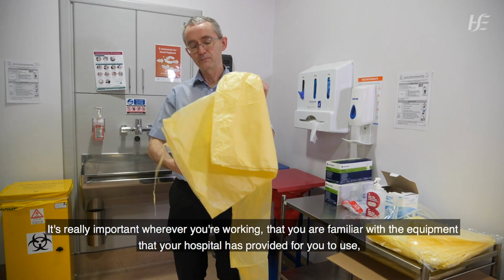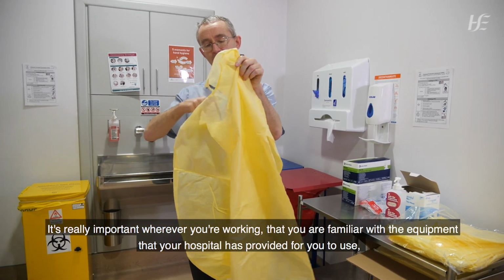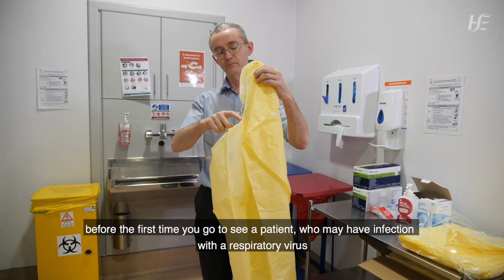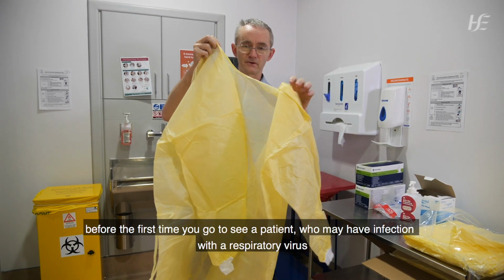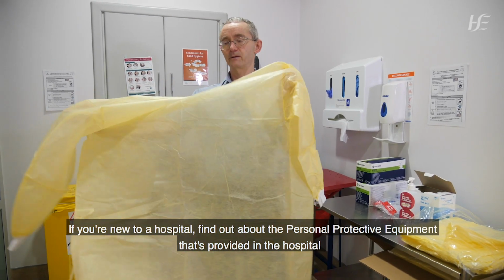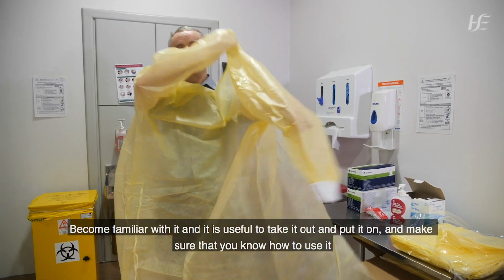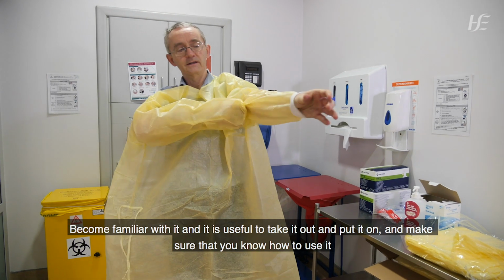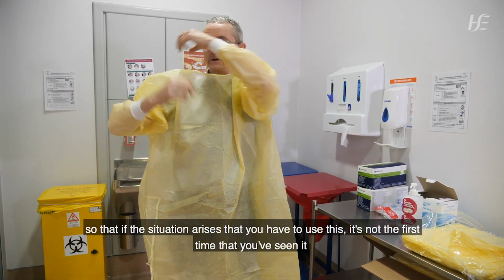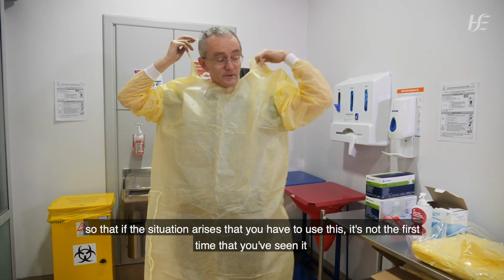It's really important wherever you're working that you're familiar with the equipment that your hospital has provided for you to use before the first time you go to see a patient who may have infection with the respiratory virus. So if you're new to a hospital, find out what the personal protective equipment that's provided in the hospital is, become familiar with it, and it is useful to take it out and put it on and make sure that you know how to use it, so that if the situation arises that you have to use it, it's not the first time that you've seen it.